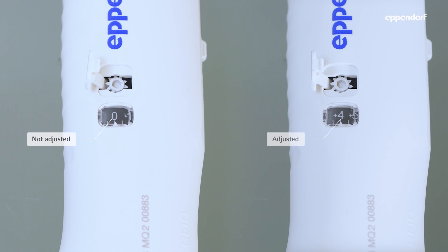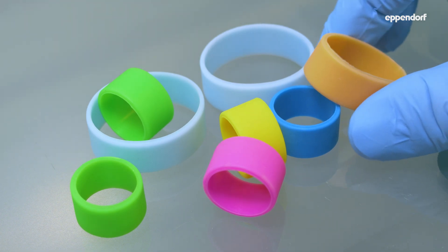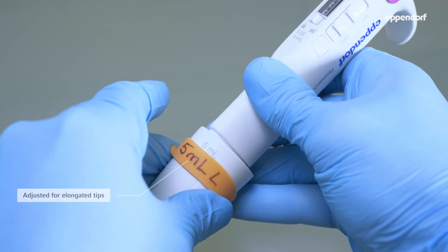To check if a pipette has been adjusted, look at the adjustment window. If the value is different from zero, the pipette has been adjusted. You can also use a color tag pipette marking ring to indicate what the adjustment was for.